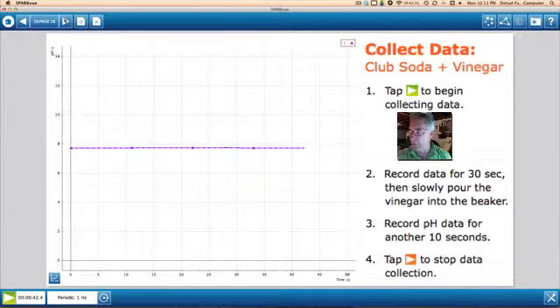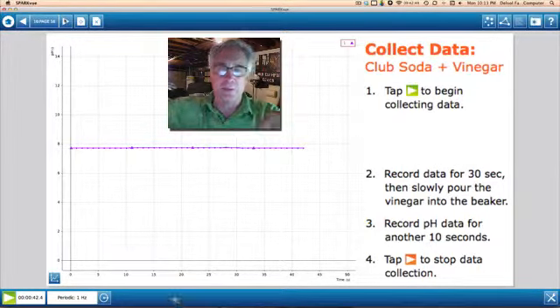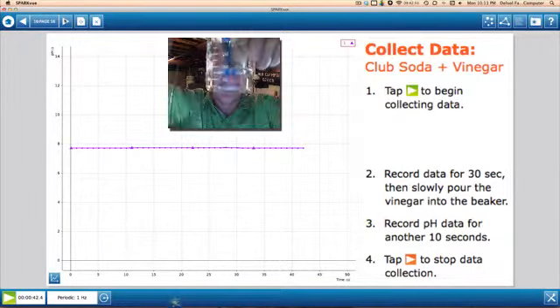let's go ahead and do that one. All right. We'll just get you started on this, and that way you can compare at least the initial portions of it. Okay, we have 100 mLs. I've rinsed off my pH meter, or pH probe, put it in there like that.